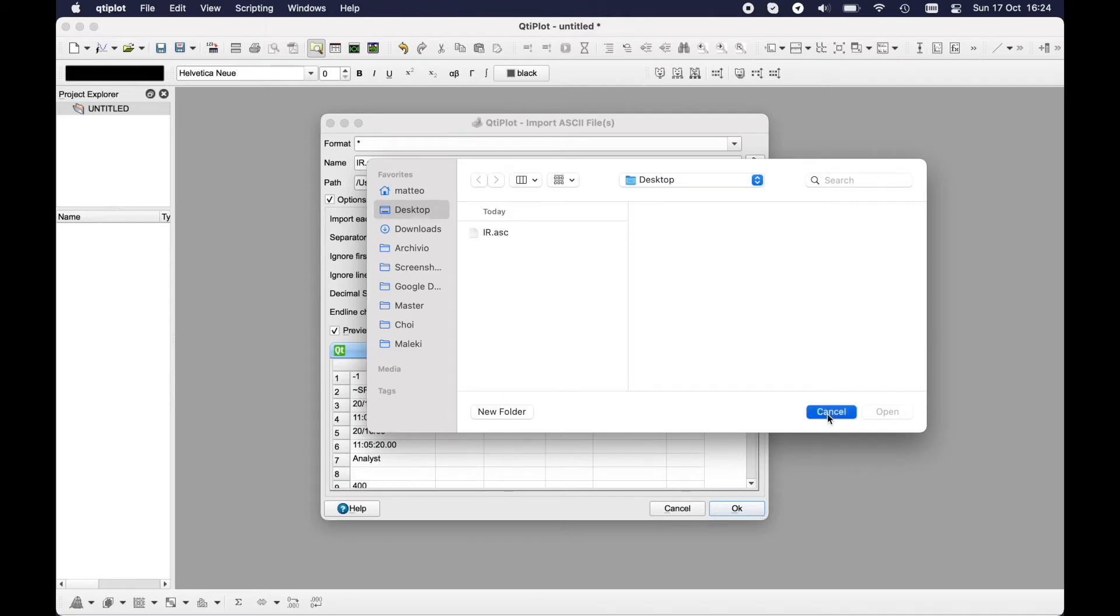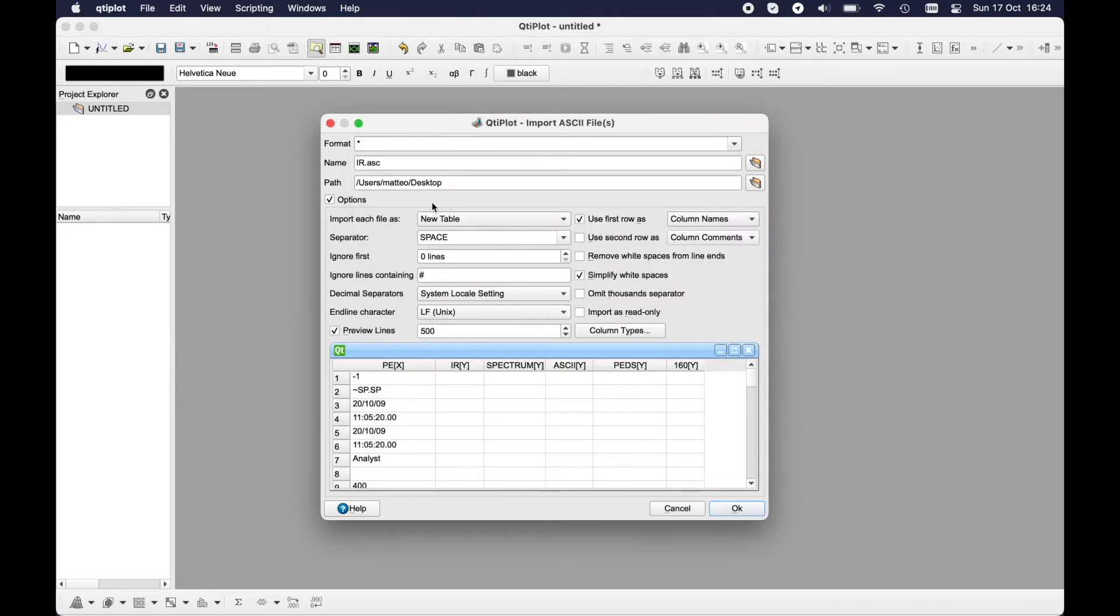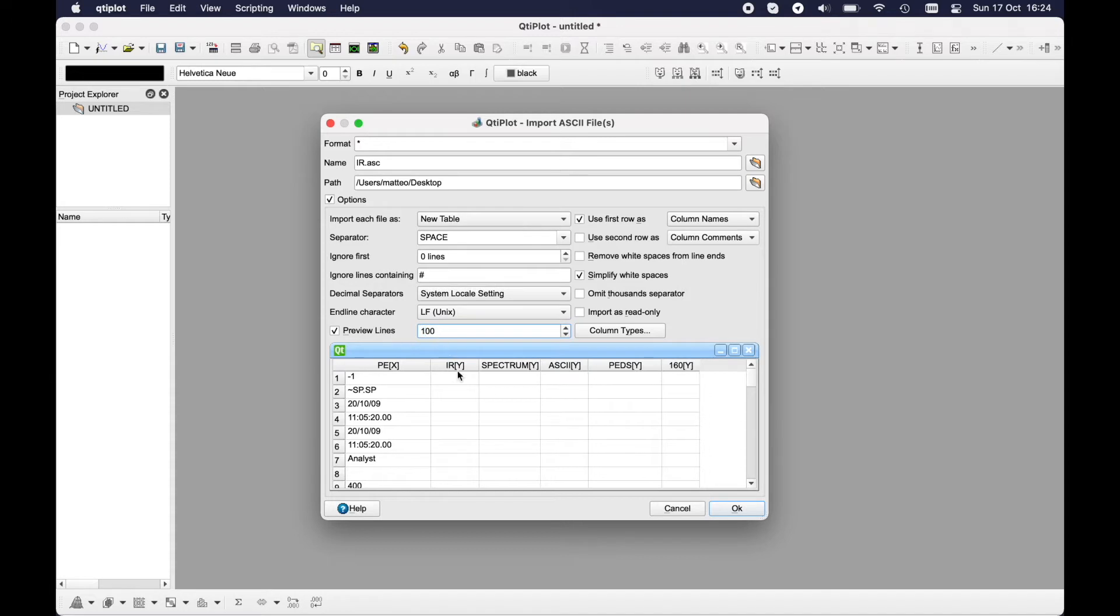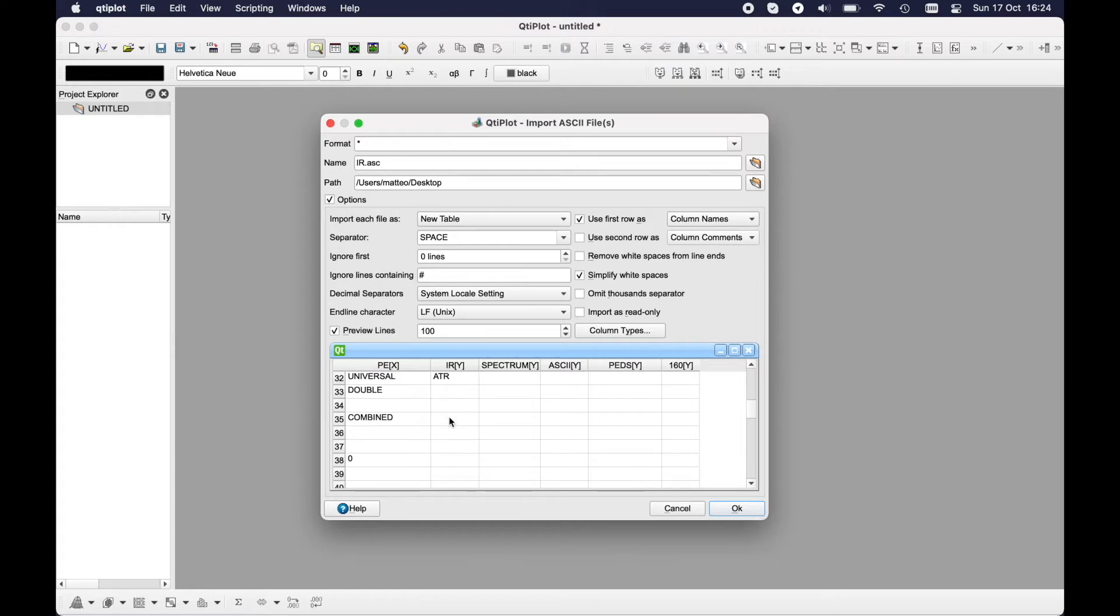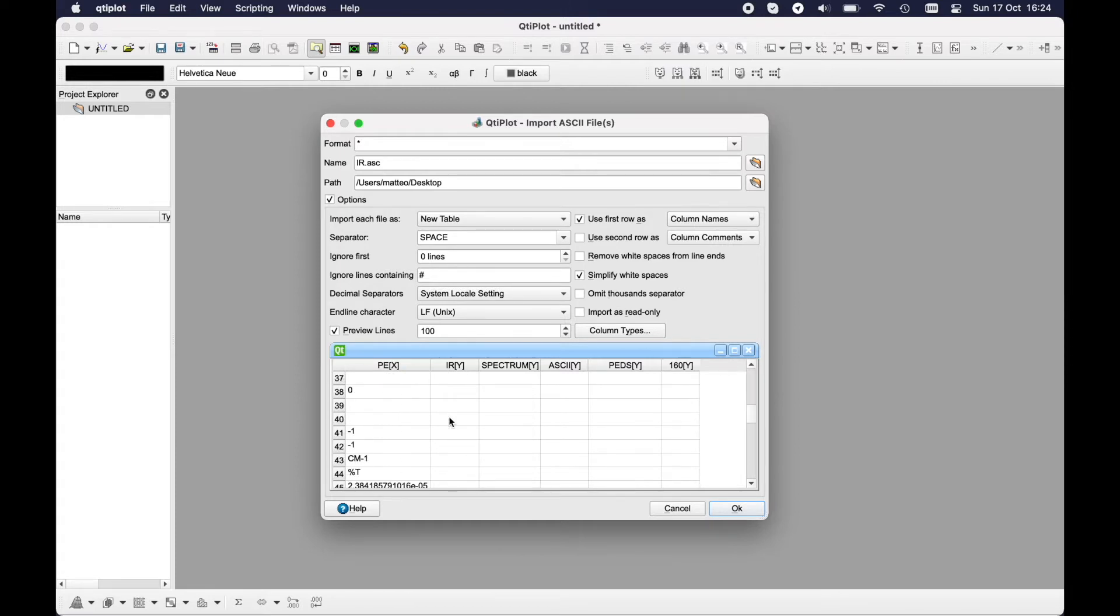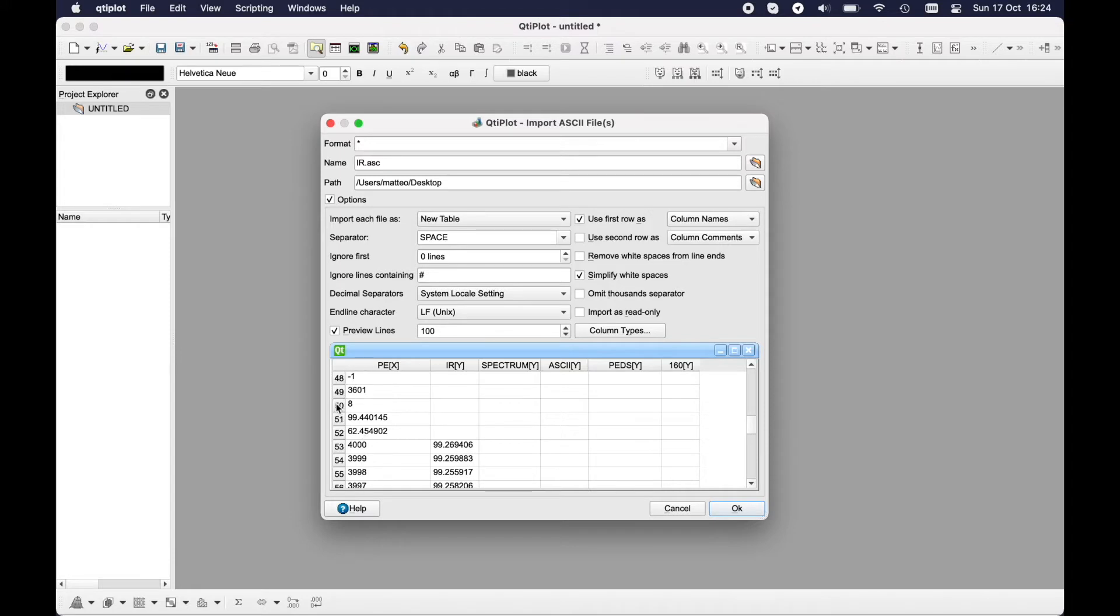At this point you have an overview of the first 500 lines, but you can also put for example 100 just to have an idea on how the final import would look like. In this case I have a bunch of lines that I would like to skip, especially the first 52 lines.